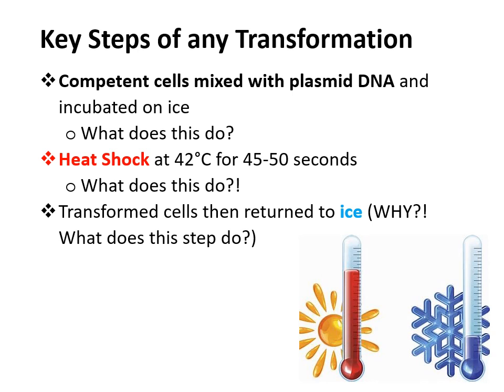Okay, so the heat shock step is to open up the pores of the bacterial cell so that you force the DNA, the plasmid DNA, into the bacteria in this step.